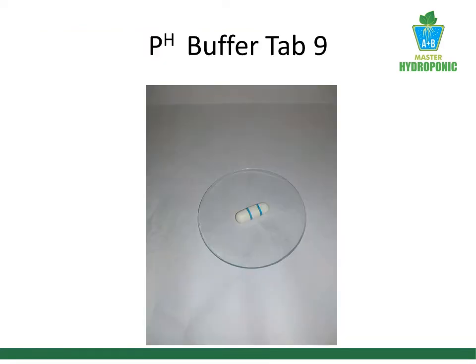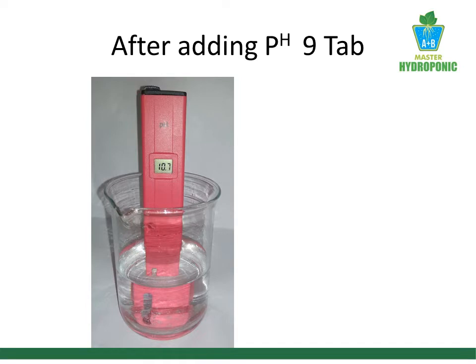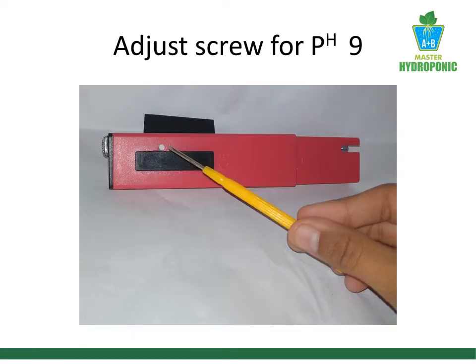Let's take a pH buffer capsule of 9. Open the capsule and add it to 100 ml of distilled water. After adding the capsule, the meter is showing pH of 10.7. Now using the calibration screw, I adjust the reading to 9.